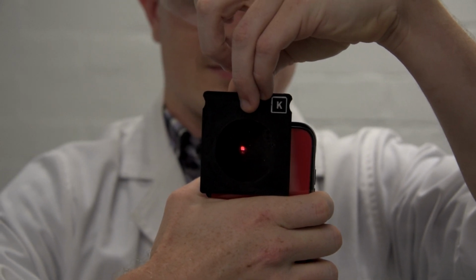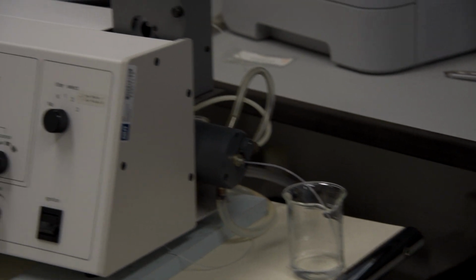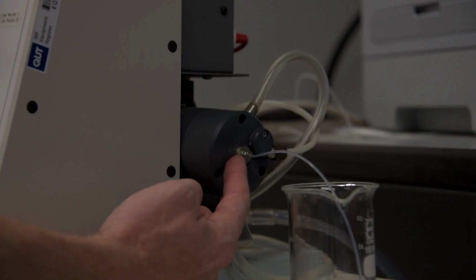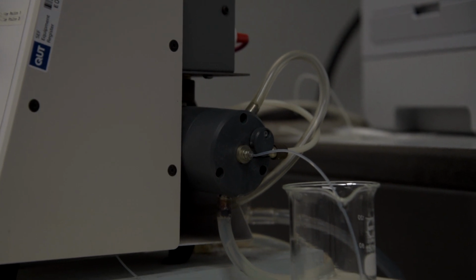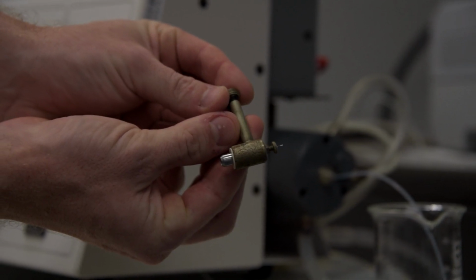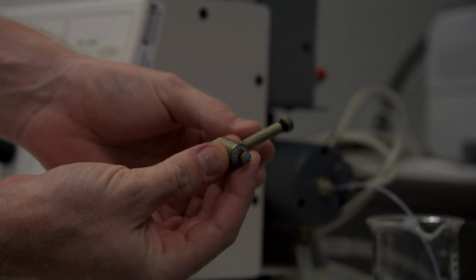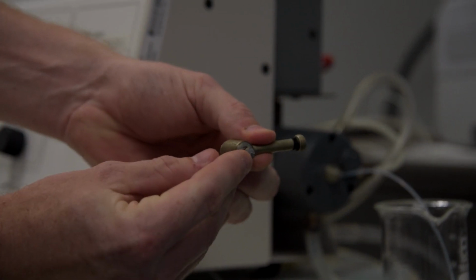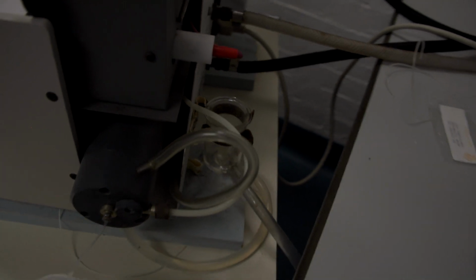The sample is introduced into the spectrophotometer through a nebulizer which uses the air for the flame to make tiny droplets of the solution. As with other forms of atomic spectroscopy, most of the sample is rejected and finds its way into the waste container at the back of the instrument. This is the glass container at the back that you can see here.